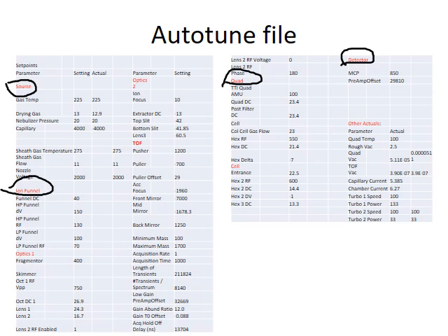In the source chamber, there are settings and actual readbacks. So this is a setting, while this is actual readbacks. Other actuals you need to note are at the end of the file, such as vacuum for the rough pump.